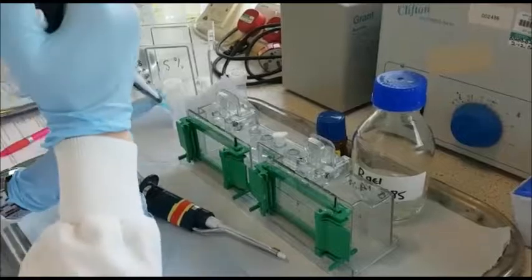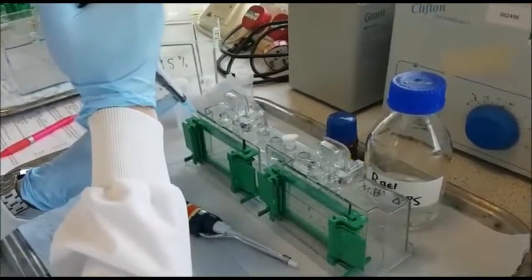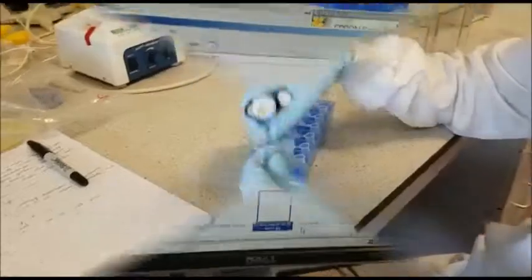Each of the fractions collected from the chromatography steps would undergo analysis by SDS page. The purpose of this was to confirm that the protein had been purified, and if not, another chromatography stage can be introduced. Here we can see the proteins being separated on the gel. And the final product. Each band within a lane signifies a different protein.